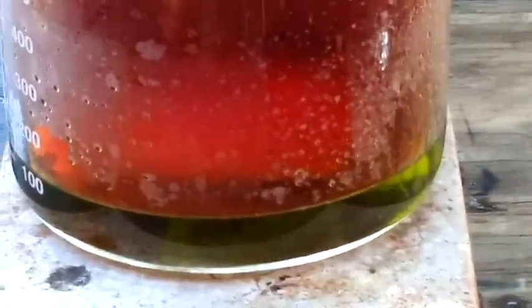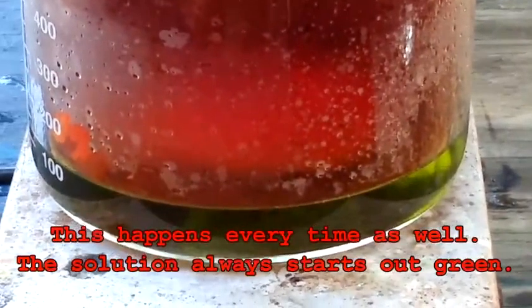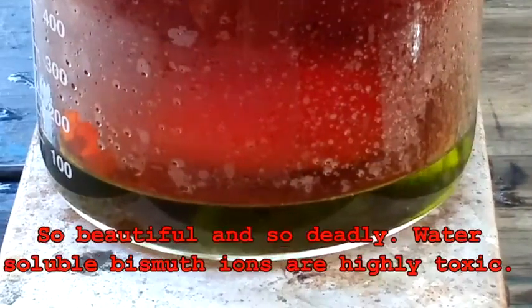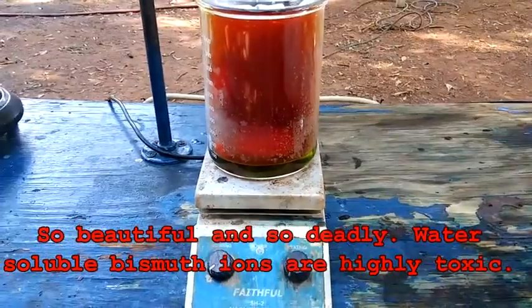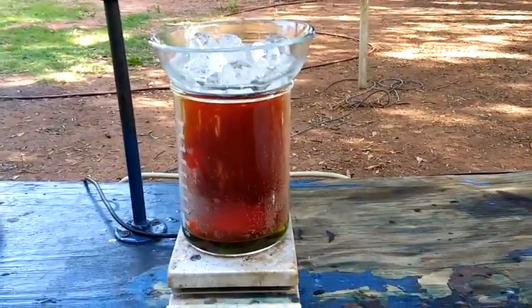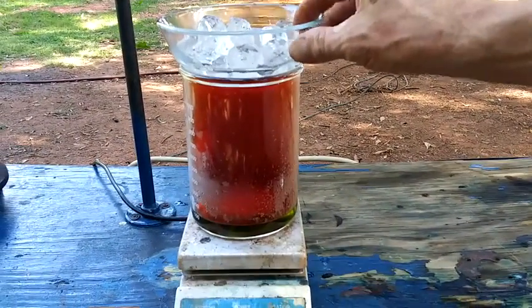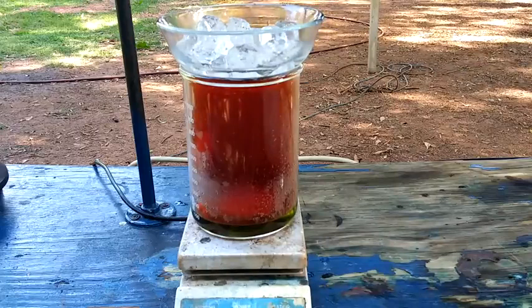Look at that. Is that not absolutely gorgeous or what? It's like Christmas in June. So, we've got some ice in the bowl up there that will help condense the vapors and drip them back down, so it'll be more efficient. And we're just going to let this run for a little while.